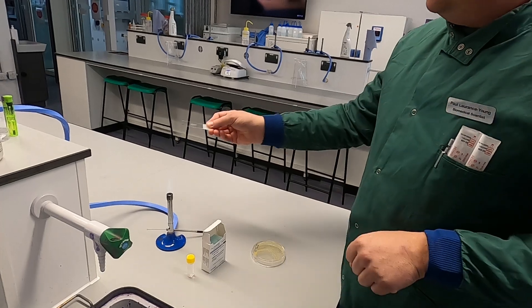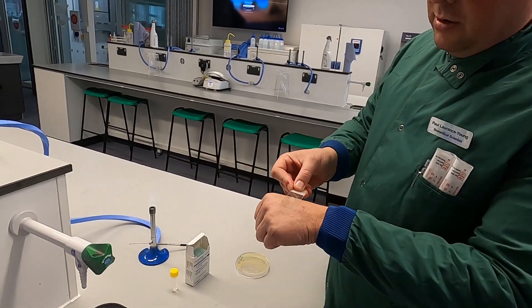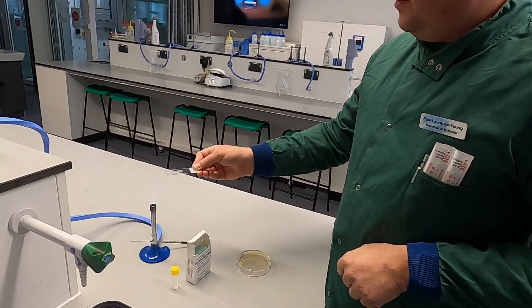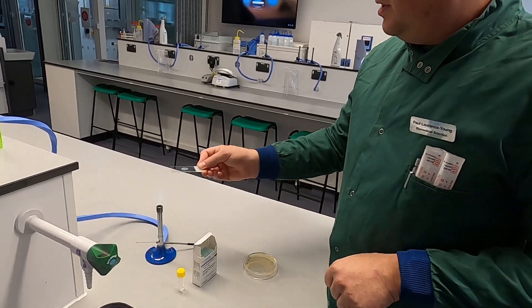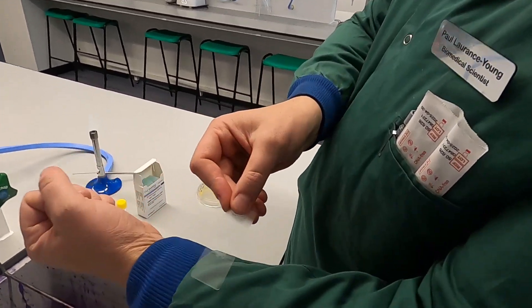Keep doing that for a few seconds until it dries. You'll know it's dry when it goes completely opaque and there is no sign of water on the surface. Such an example would be one like that.